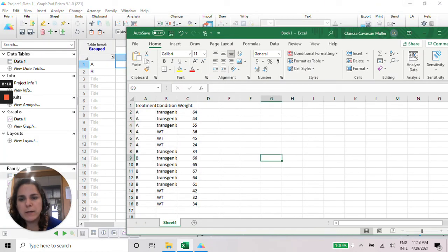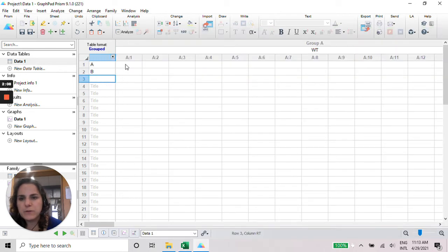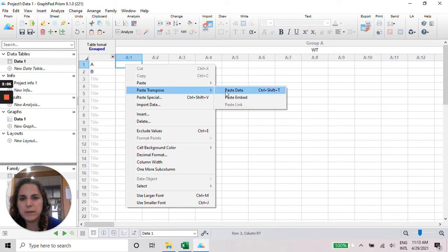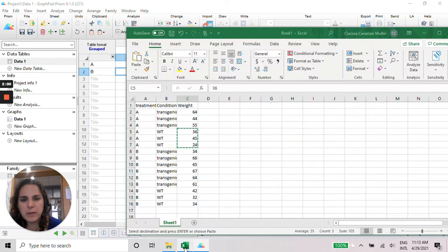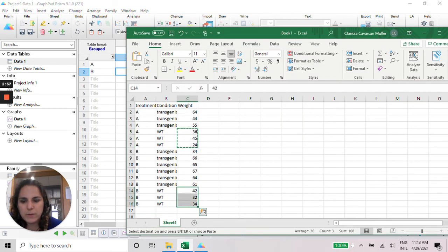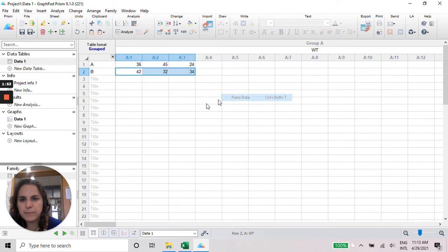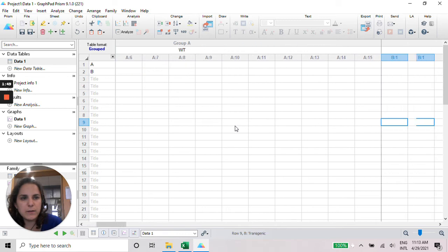So I need wild type A, these are the data. Let's just copy and paste here. You can paste transposed to make it to the side. And when it's wild type B, these ones, the same thing in the other one.